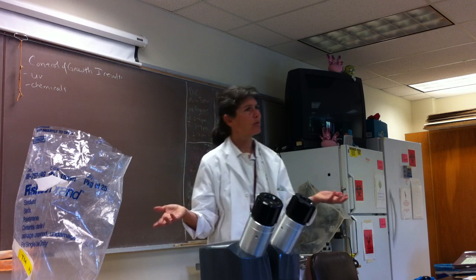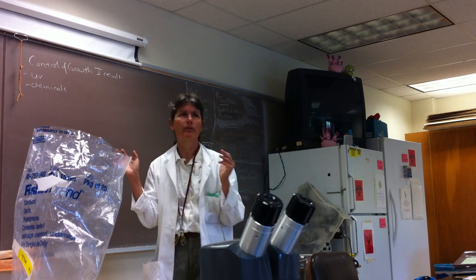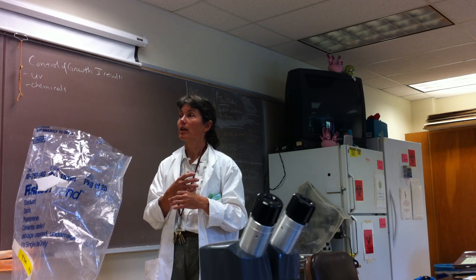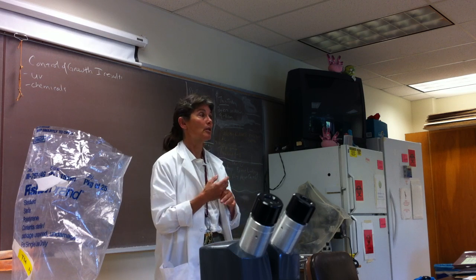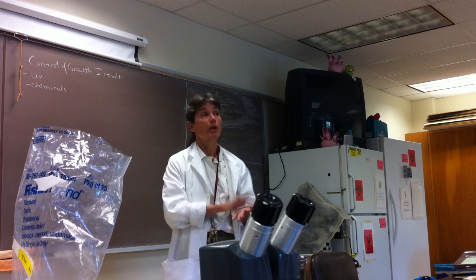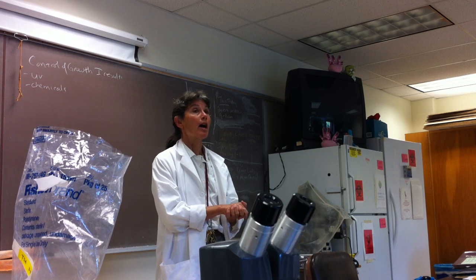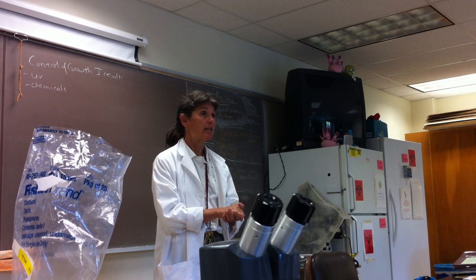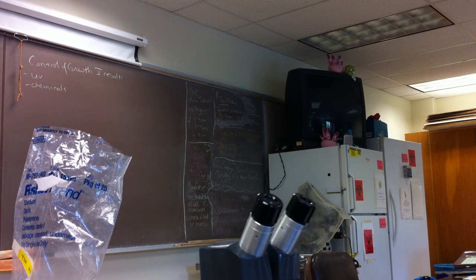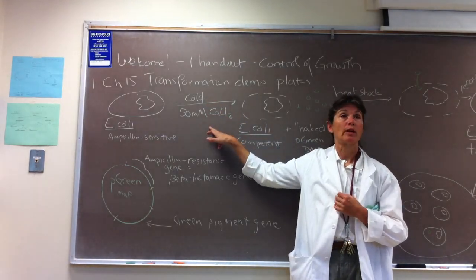But through some incredible research and experiments, it blows my mind that people figured these things out, scientists were able to devise a way to artificially make E. coli competent. So, one of the questions I will surely ask you on the quiz is, how were the E. coli treated to make them competent? And the answer is, we treated the E. coli with cold calcium chloride.